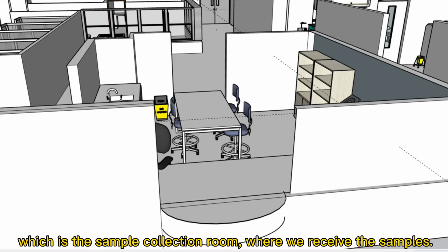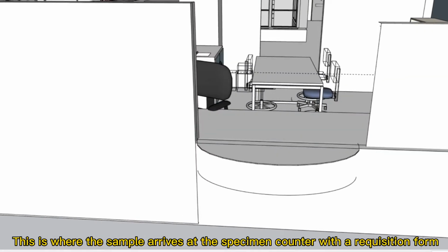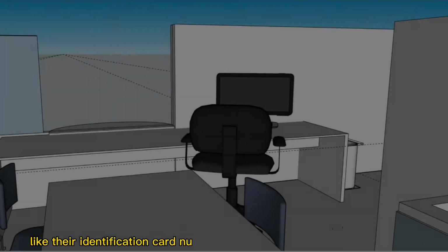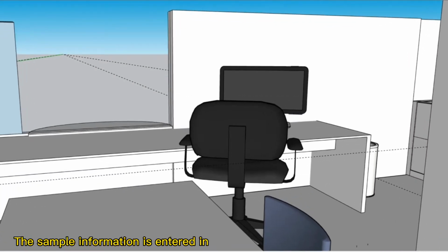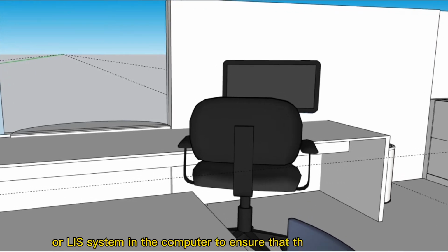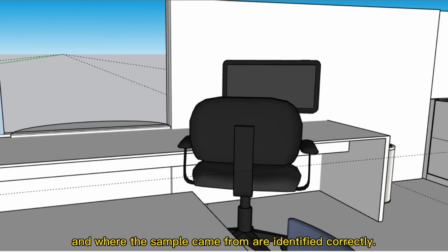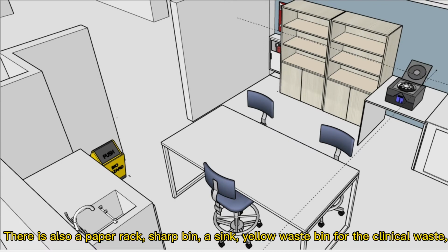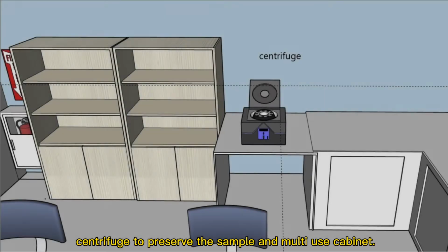Now, let's begin our tour in the preparatory area of the laboratory, which is the sample collection room where we receive the samples. This is where the sample arrives at the specimen counter with a requisition form that has the patient's name and some specific identifiers on them, like their identification card number, date of request of the test, and so on. The sample information is entered into a hospital laboratory information system, or LIS, in the computer to ensure that the patient's name and where the sample came from are identified correctly. There is also a paper rack, sharps bin, a sink, yellow waste bin for the clinical waste, centrifuge to preserve the sample, and multi-use cabinet.